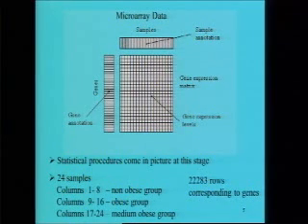So going back, see what it is that we have to now study. These 24 columns, apart from the first column, that is the gene identities. So the main data matrix has the expression values in 24 columns, and what you have to do is check whether the gene expression values in these 3 groups of columns, each consisting of 8 columns, are similar or not. In statistical language, what we want to test is whether the entire genome of the non-obese group, obese group and medium obese group is the same or different. The null setup is always that they are the same, but comparing the genome means comparing the gene expression values of all these 22,283 genes. Therefore the first step is to divide this entire family of hypotheses into the hypothesis corresponding to each gene.